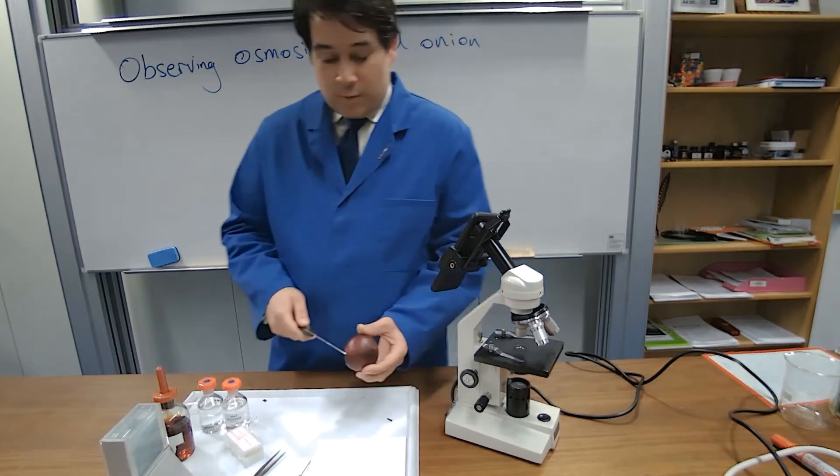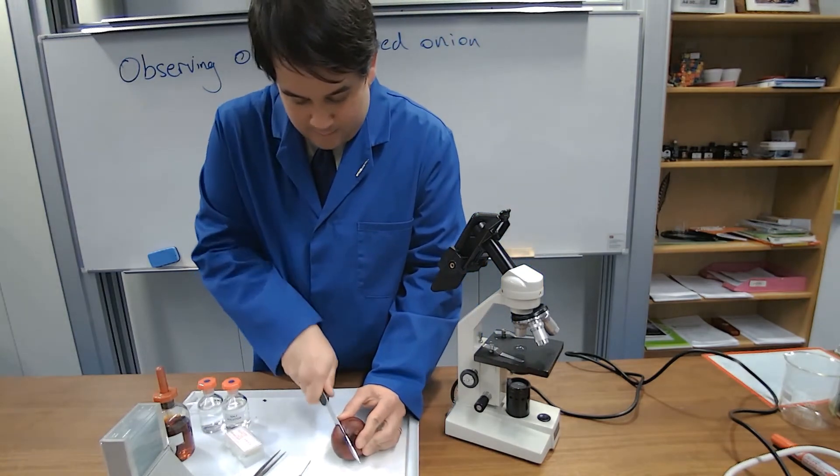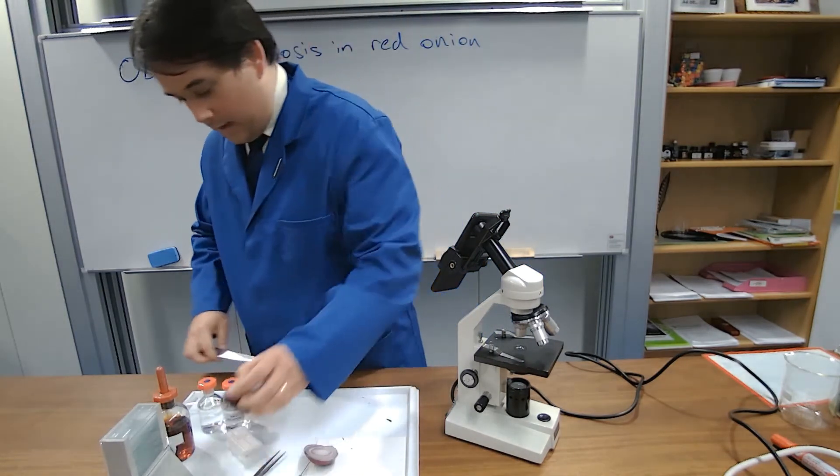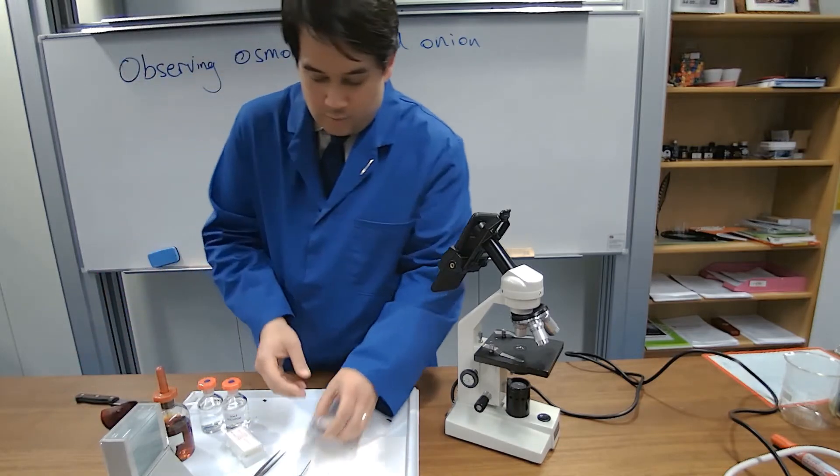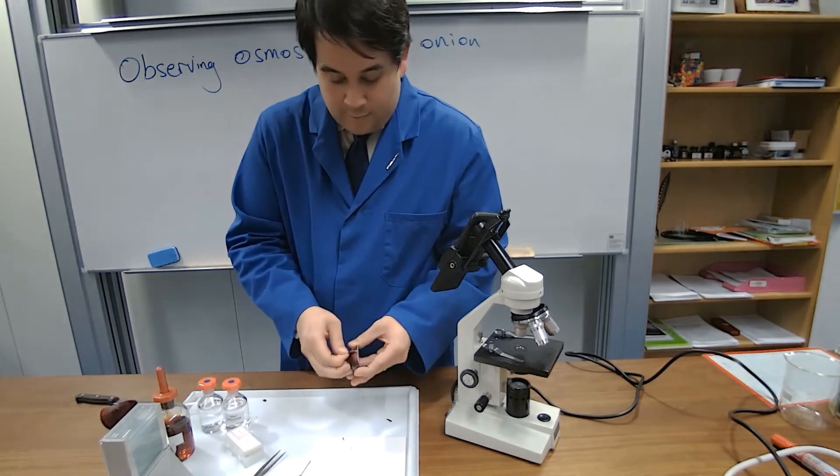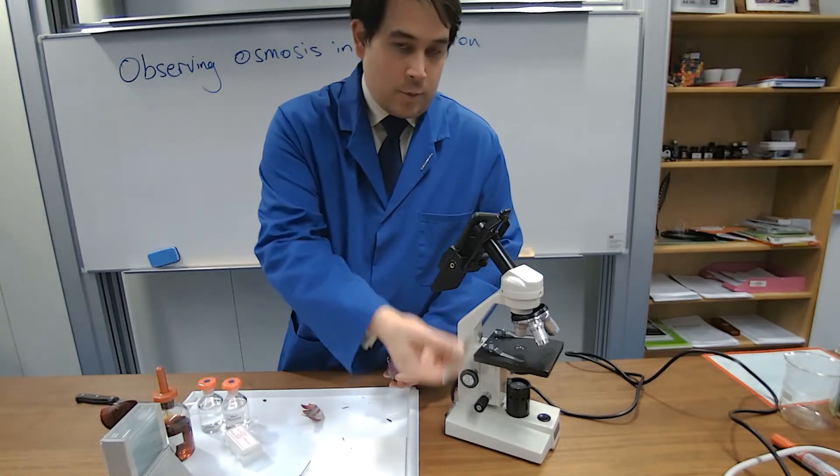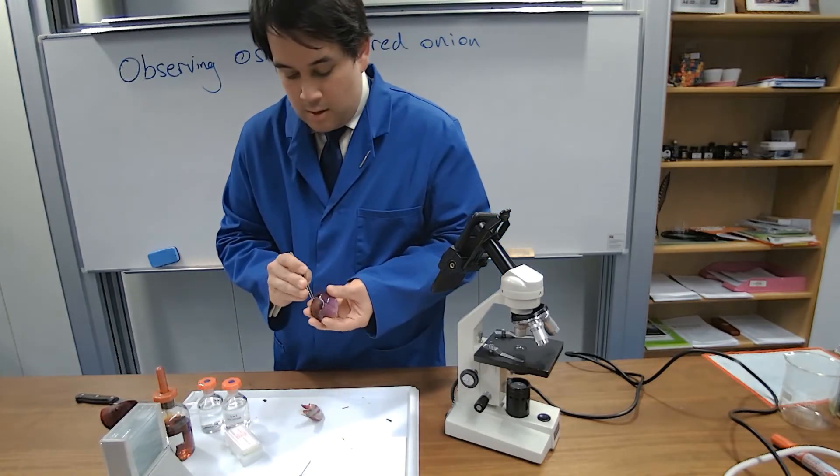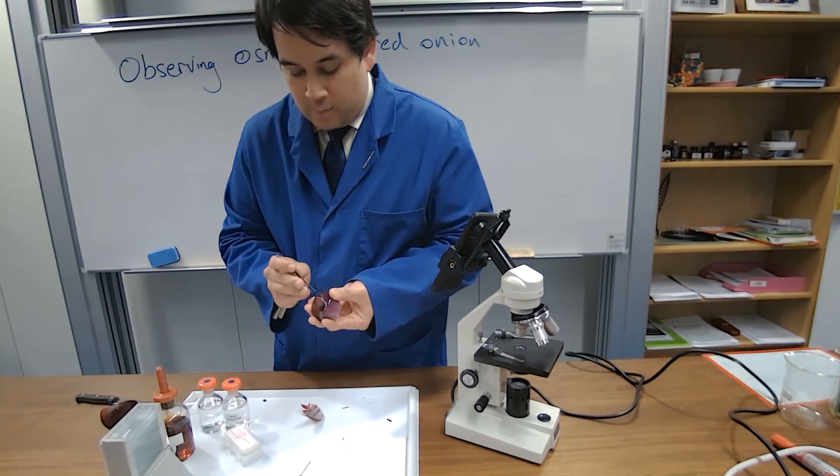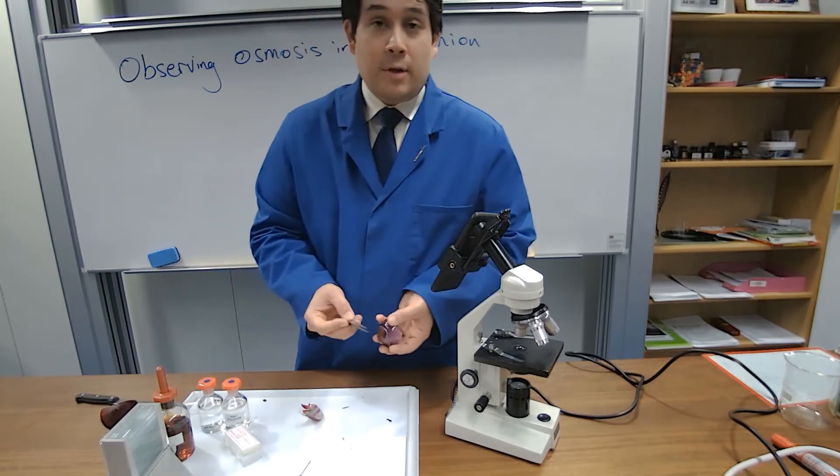First, we're going to be cutting out a specimen of red onion in the same way that we did before. I'm going to take a very thin slice of red onion, thin because we're using a light microscope, and from there we're going to be adding two different types of solutions to it.